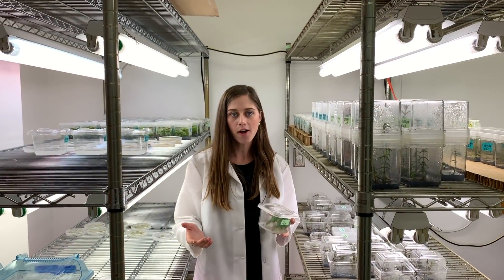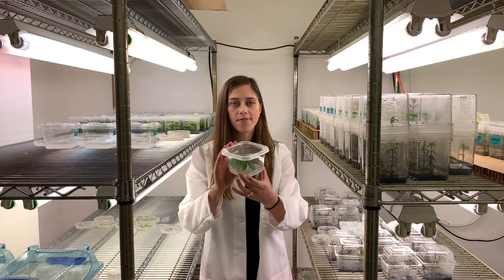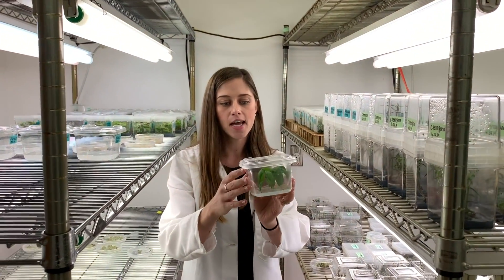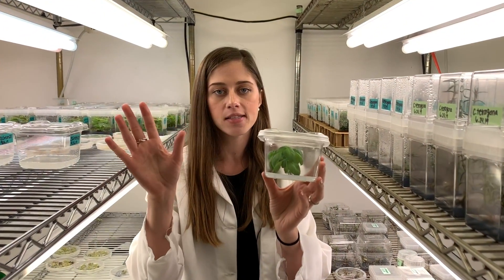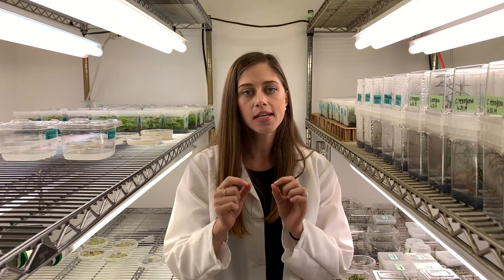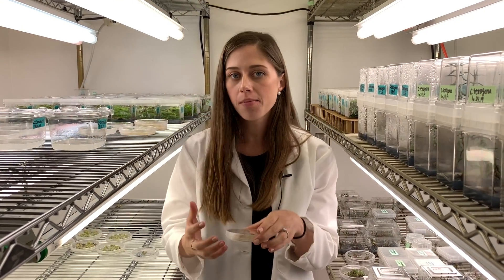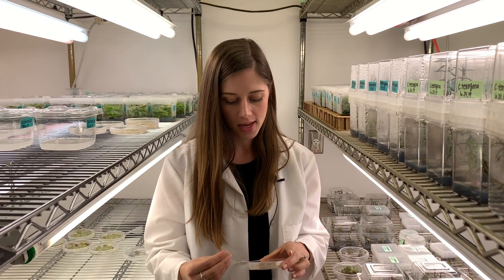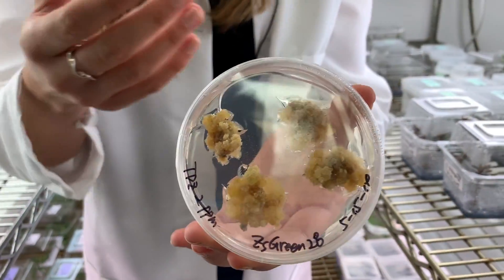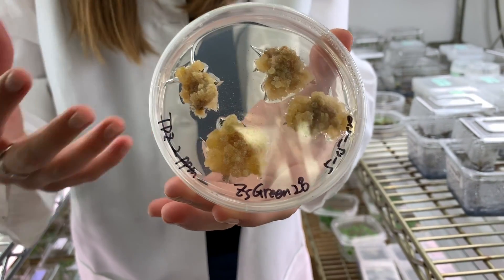We start off tissue culture and plant regeneration by growing our plants in a sterile environment, just like in these little Tupperware containers. This plant is not contaminated by any other bacteria or anything outside of the air. Next, we cut them up into teeny tiny squares and we place them on a plate that has growth medium and different hormones on it to mimic different stages of development. We create something called a callus that is very similar to a tumor or maybe an embryo before it becomes differentiated.